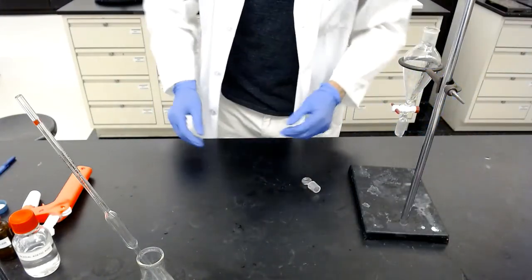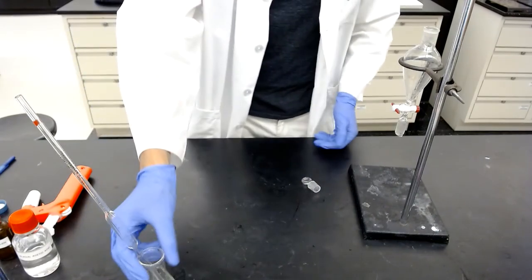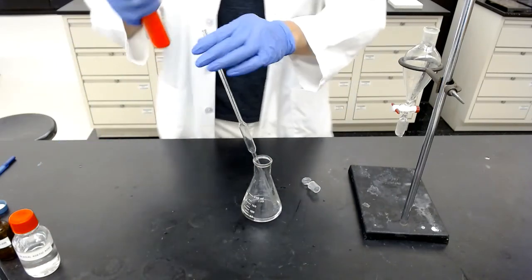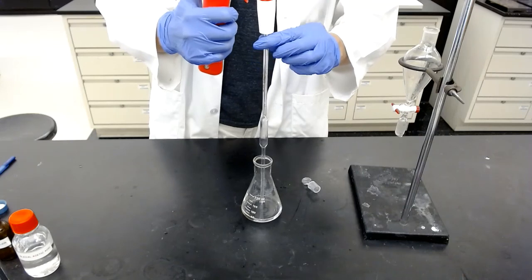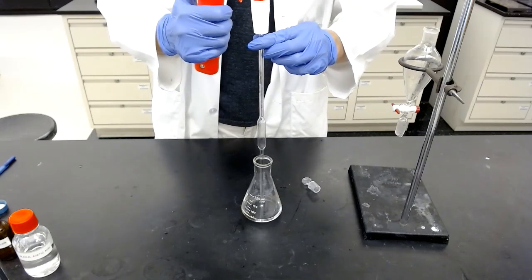All right, step number 5 is saying take a third 10 ml aliquot of stock acid solution. All right, here we go. We take another 10 ml of fresh stock acid solution.